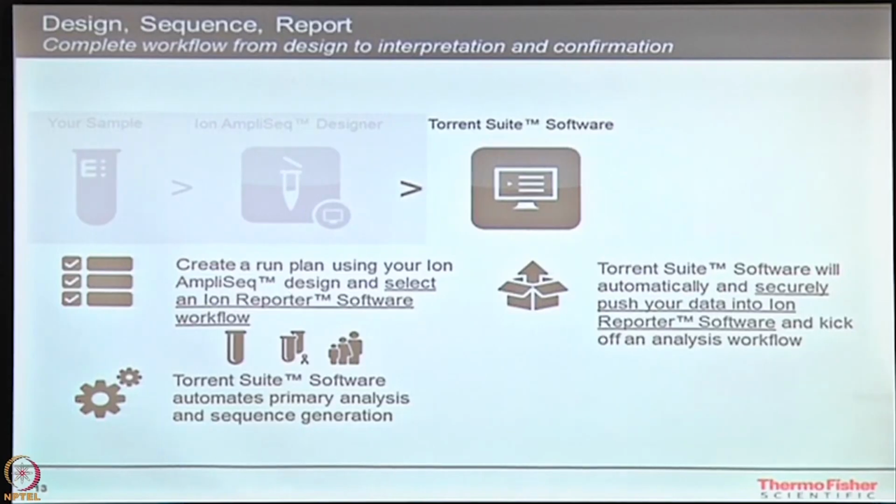So, once you are done with the variant calling, you just have variants with you, right. You have just the SNPs giving you the change from A to T, C to T, or just the deletions, A is deleted or T is deleted. But you still need to know something more about it, where exactly this is happening, which gene it is happening in, whether it is actually having deleterious effects or not, whether it is having any effects with the patients or not, right.